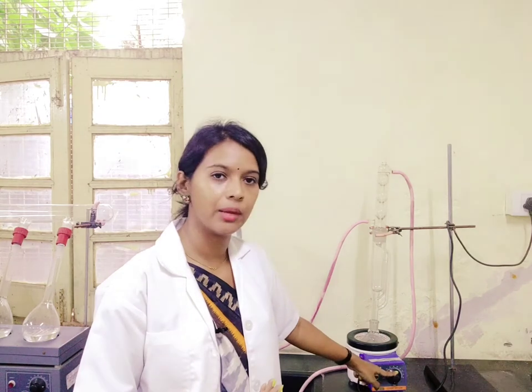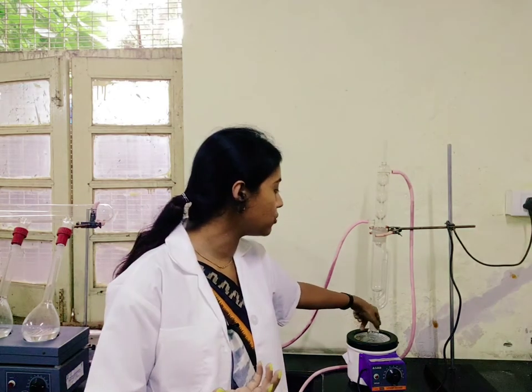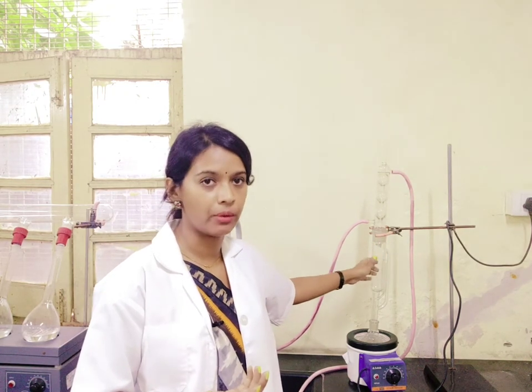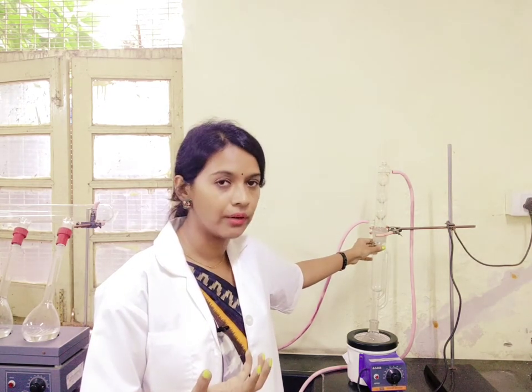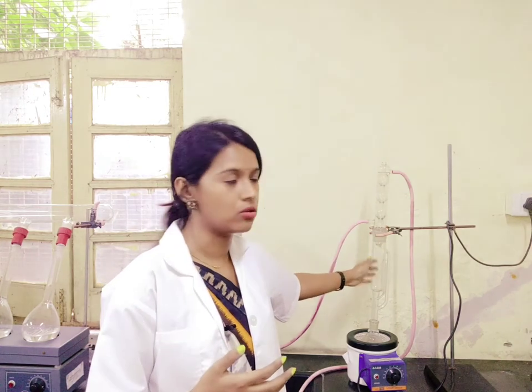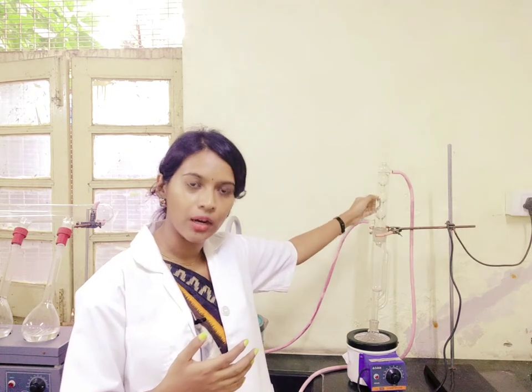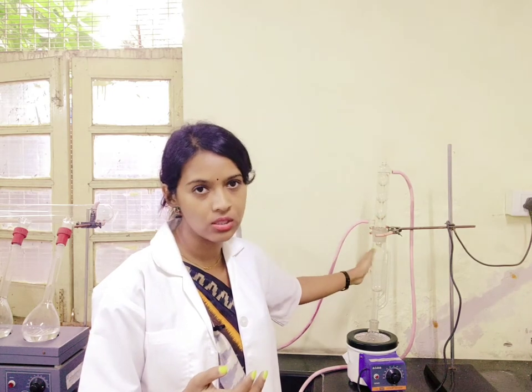Once the temperature reaches the solvent's boiling point, the solvent starts boiling and the vapour formed will travel through the distillation arm upward and then flood into the Soxhlet chamber where your sample is placed. The fat will get extracted into this heated solvent. Once this solvent in the chamber gets heated up, it will also form vapour and rise up, but because there is a condenser tube, it will cool down the vapour and in the form of droplets it will trickle back down into the Soxhlet chamber.